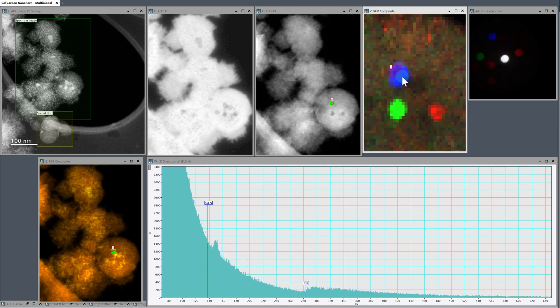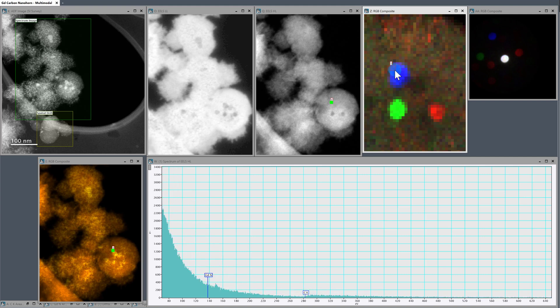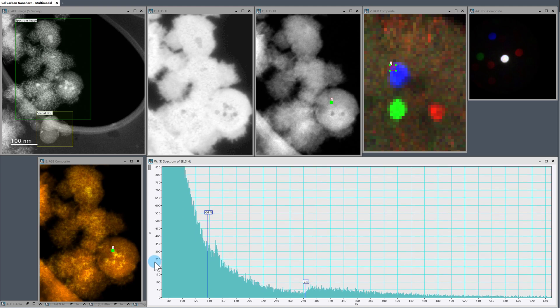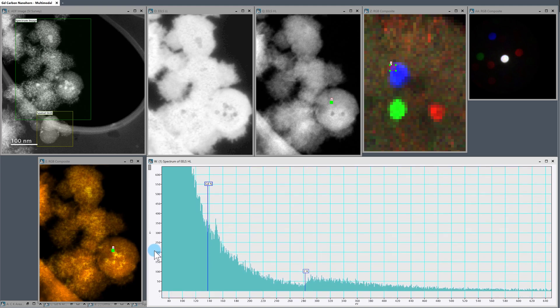So one thing, we're using an electron counting detector, so we don't have any read noise, and we just have shot noise. So we are always going to help ourselves by summing data. Our signal to noise ratio is going to improve. But you can see if we go down to a single pixel or just a few pixels, with the particular configuration here, the signal to noise ratio is still quite low.